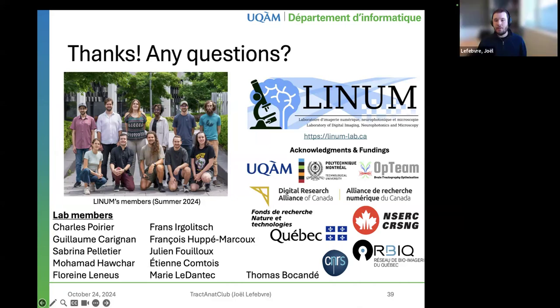I think it depends on what you want to show, at which scale, and what interests you. For example, if you want to study the microcircuitry of small local networks, I think the only technique that can give you that information is electron microscopy, where you will segment individual neurons, you will find the synapses, you will find how everything is connected together. You need that scale to study this.